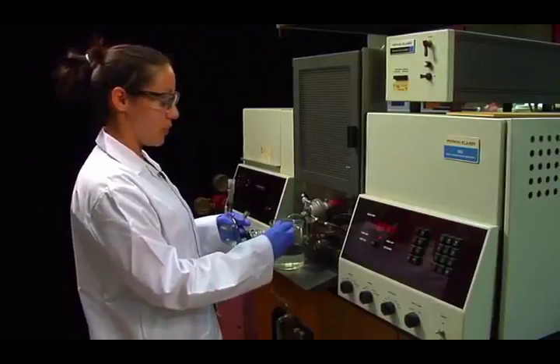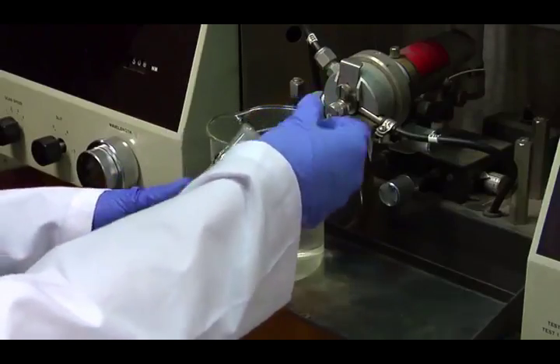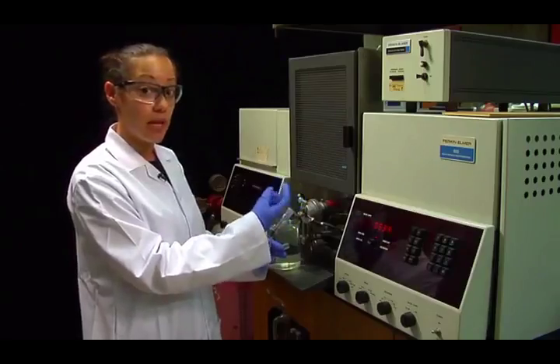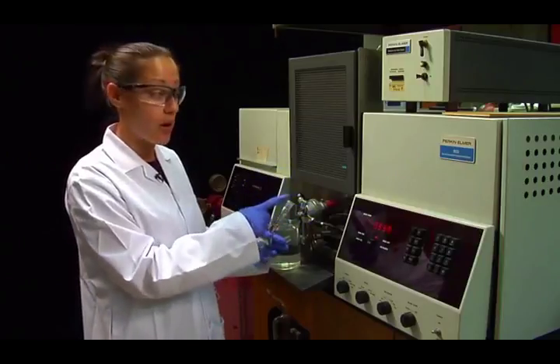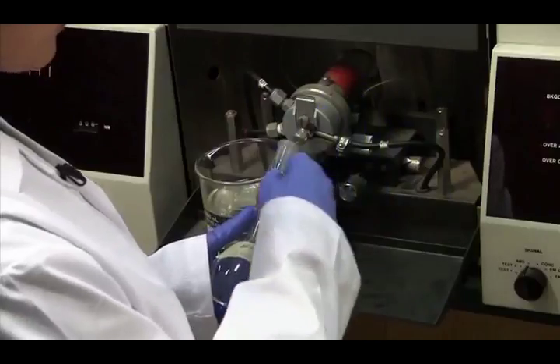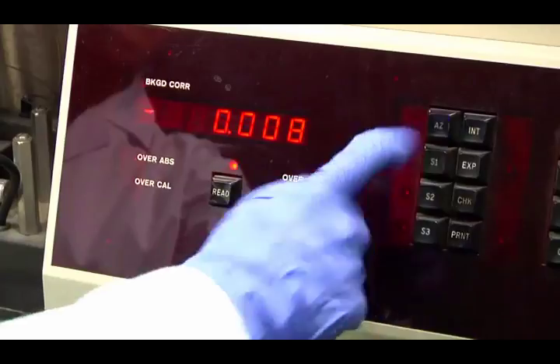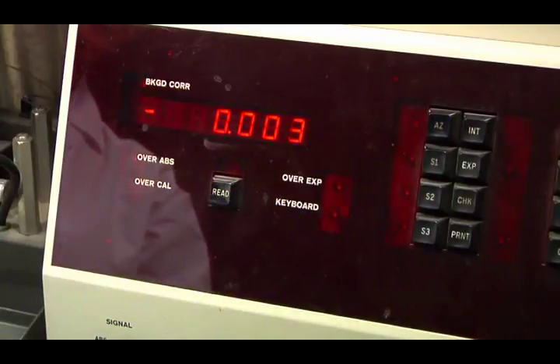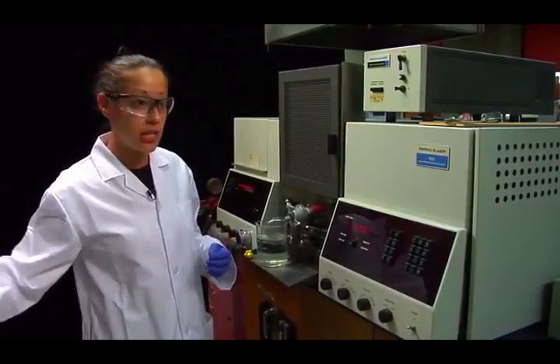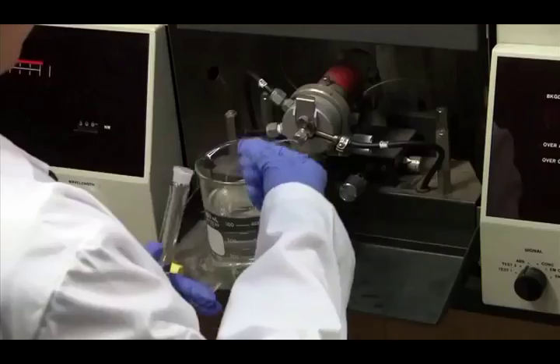So it's really simple. This is just your nozzle. You insert the straw into your sample, and it automatically sucks up your sample, aspirates it into the flame to create atoms. This is how we atomize your sample. And then once your sample is being ingested by the flame, press auto 0 to make sure your background is corrected for. So once that's accomplished, then it's just really a matter of measuring each standard relatively quickly, since your absorbance is an instant reading.